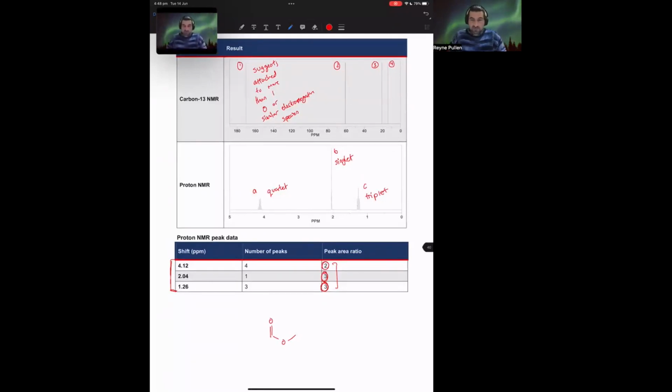But then when we look at our peaks A and C, A is telling me that we've got something that has 3 protons near it. It's a quartet, the N+1 rule, but it's also de-shielded. So it must be near something that is de-shielding it, so near something electronegative. So I reckon that there must be 1 more carbon coming off of the right there.